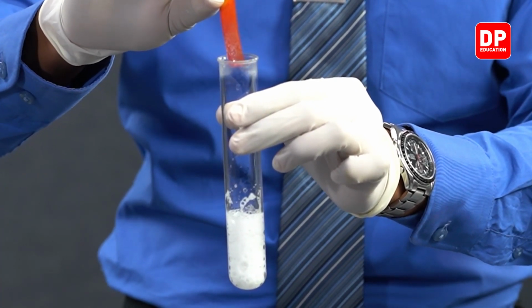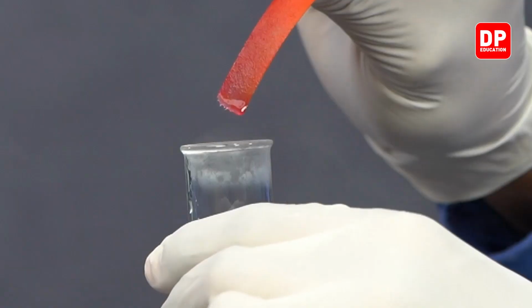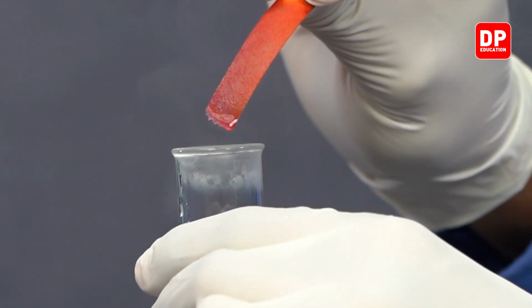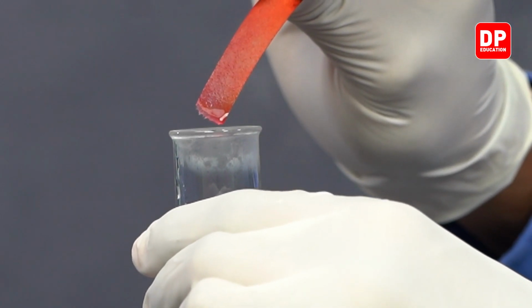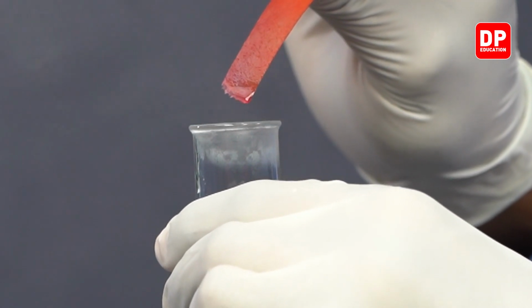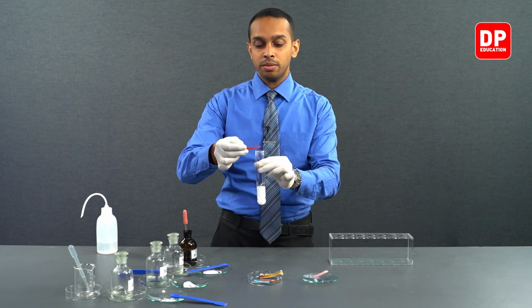Immediately, when you hold the pH paper, you can see the pH paper is turning red. Red indicates high acidity. However, after a while, we will compare it against the pH scale that is provided with the pH paper book. Right, everyone?